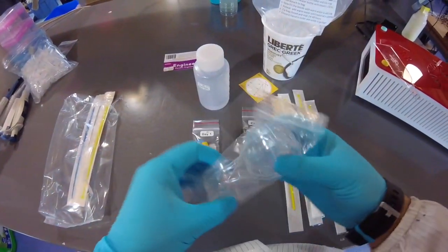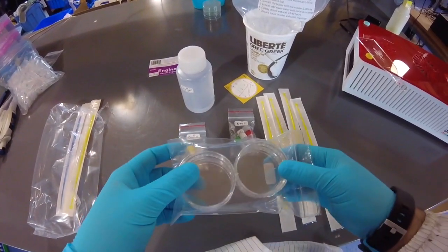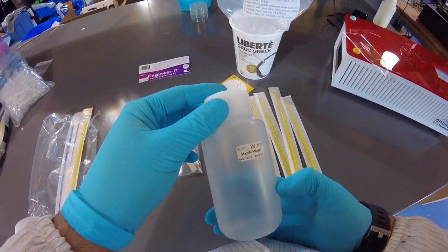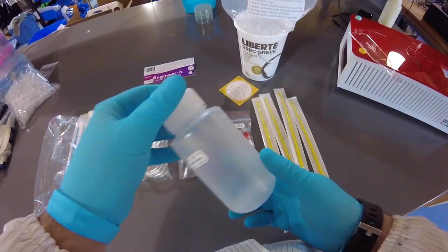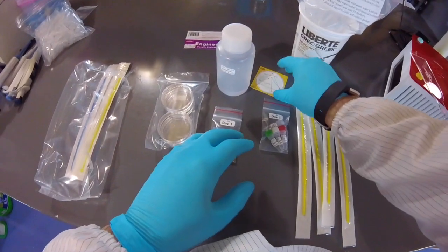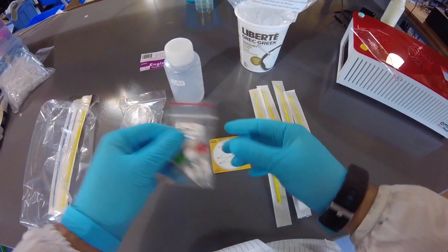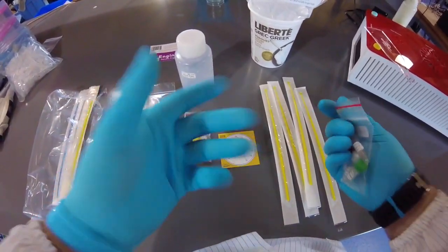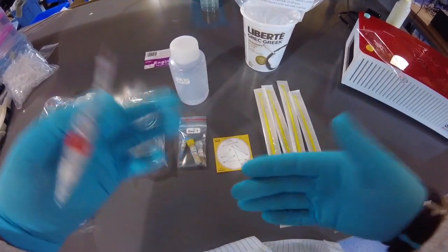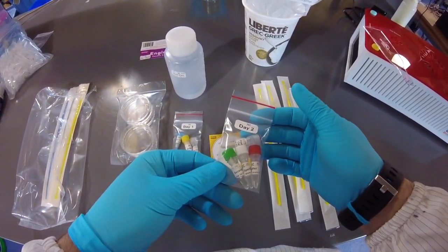Next, we have Petri dishes. Again, this is what we're going to be putting LB agar into, and this is where the bacteria are going to grow. Okay. We've got sterile water, and this is what we're going to mix some powder into to make that jello-like LB agar. We've got a stencil, which we're going to use today to help us streak cells so that we can get some colonies. And colonies are these little mounds of cells that are growing, and the goal is to get some of these mounds of bacteria or colonies so that we can engineer them tomorrow.